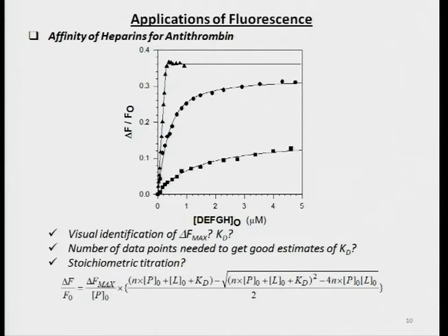All of this, right up to the fully formed complex, is completely linear, and right at that concentration, 1 unit of ligand divided by 1 unit of protein, if that ratio is 1, you will saturate it completely and see no further change. That is a stoichiometric titration. So you can use this equation for that profile and measure the N.